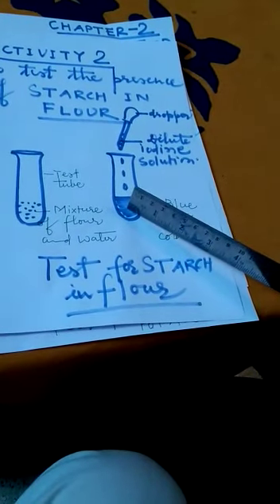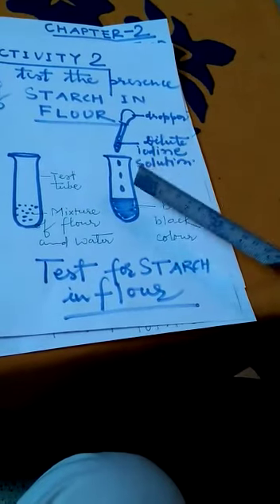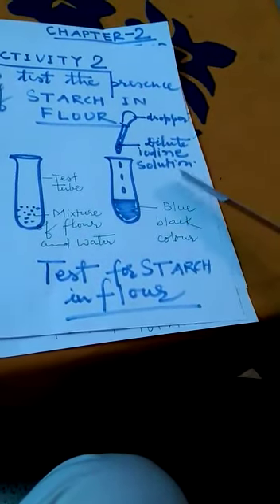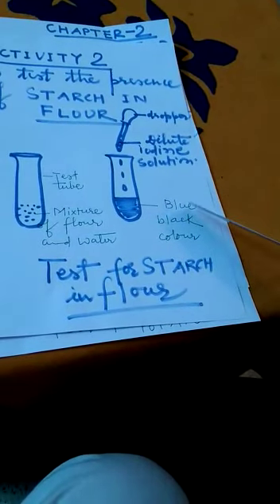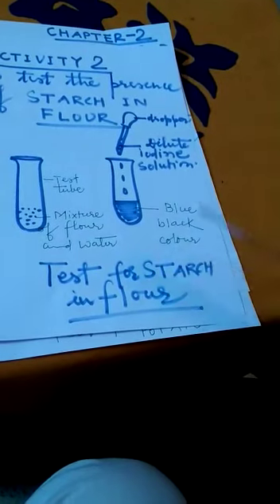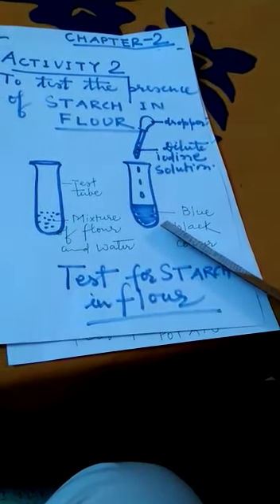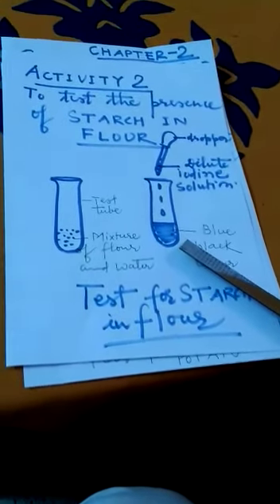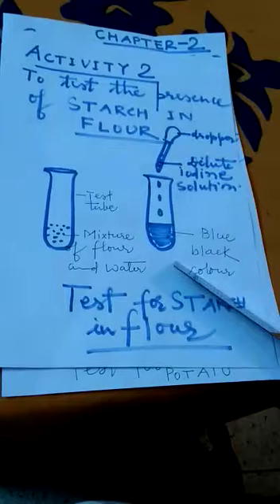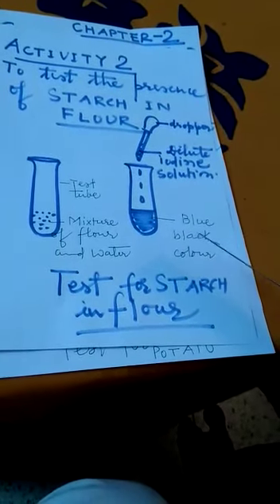Children, the mixture of flour and water turns blue-black in color. So a blue-black color appears in the test tube. This shows that starch is present in the flour. We can repeat this test with a piece of bread. We will get the same result.